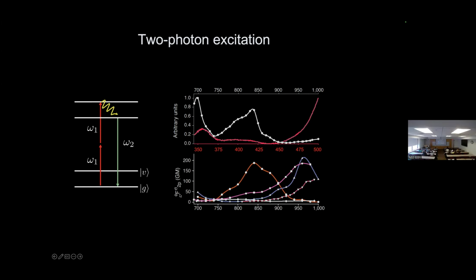This is the two-photon quantum yield of certain chromophores, and it's indicated in Goppert-Mayers, and these are typical quantities. Again, for different chromophores here, you see a lot of interesting and useful chromophores have great two-photon fluorescence quantum yields in the range, which is a good range to be at for two reasons.